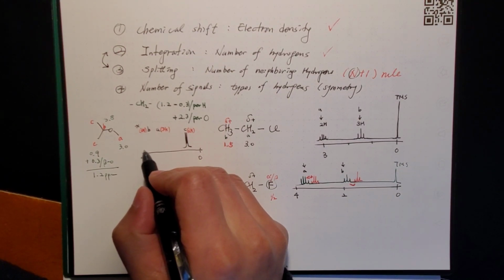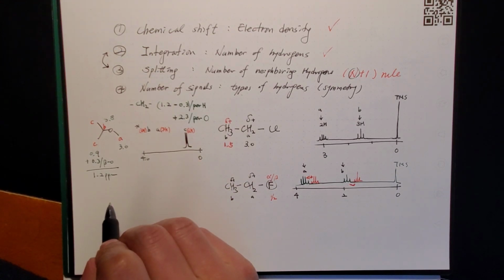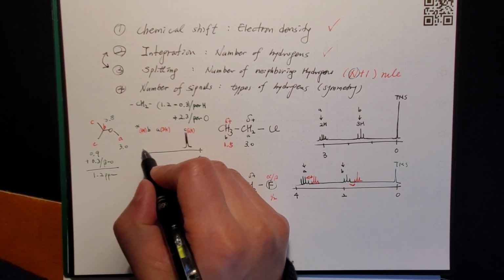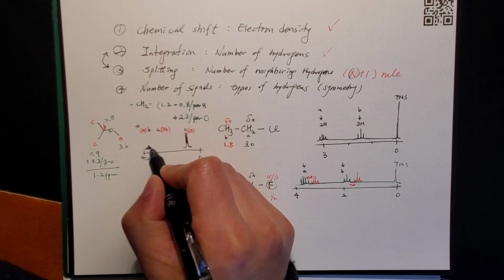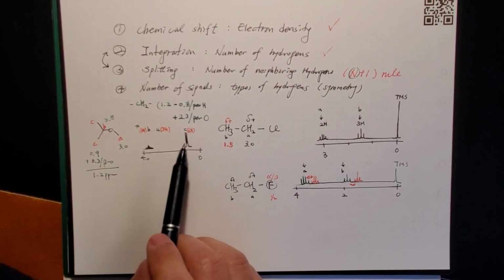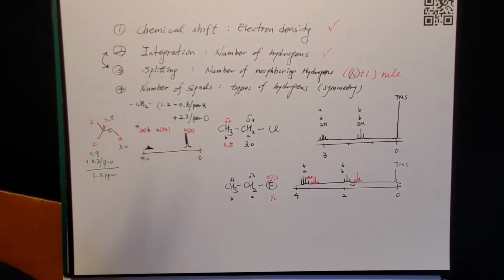So again, in the 7 line structure, you have to put the middle one tallest, then the side one less, and then the side of the side even less, that kind, right? So 1, 2, 3, 4, 5, 6, 7, something like that. Almost invisible. Looks like it's a noise. If this was an IR spectrum, you'd say this is an sp3 CH, but this is a noise. But it's not the case for NMR, so be careful.